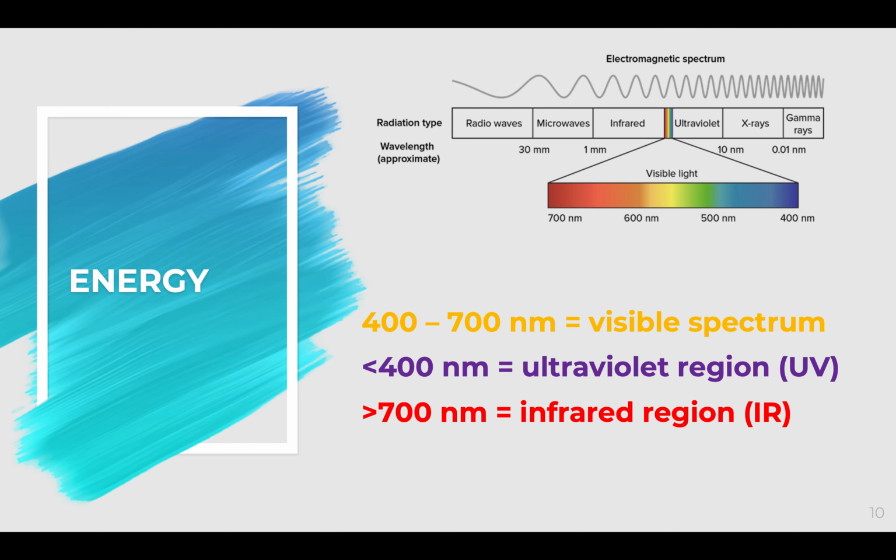Having said that, as we go on, from your frequency and your wavelength, we go now to your electromagnetic spectrum. When I say electromagnetic spectrum, the visible light that you are seeing appears to be only white. But if you dissect that light, or look deeper into the spectrum of that light, you would actually realize that it is not just the color white. Okay? It's not just colored white.